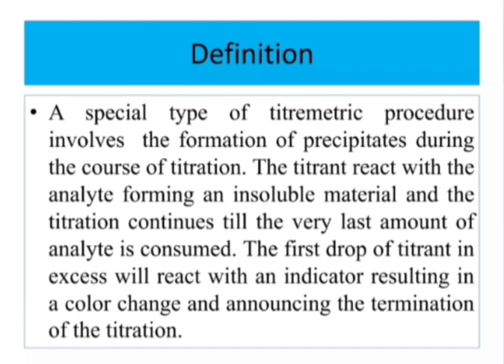In this type of titration, the standard solution and the reactant substance react and lead to slightly soluble salts as the primary reaction product, or precipitate. In precipitation titration, precipitating agents are used to determine many analytes. Example: silver nitrate is used as a precipitating agent for the determination of chloride.